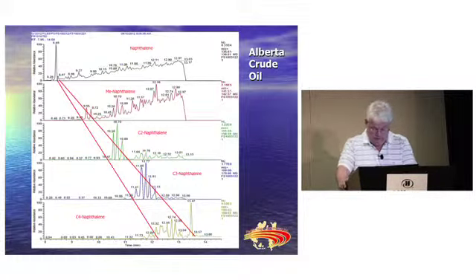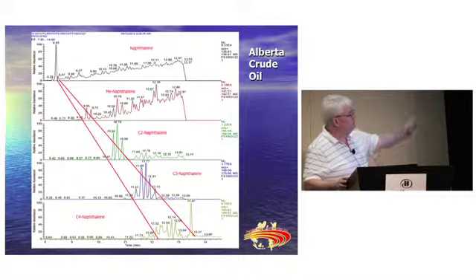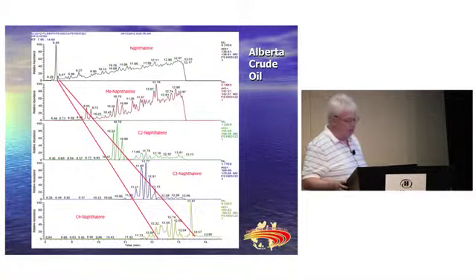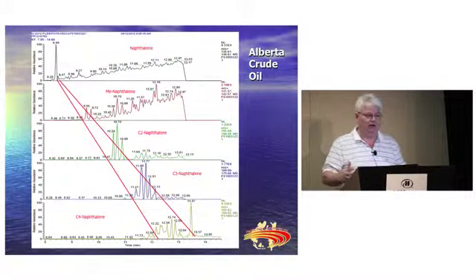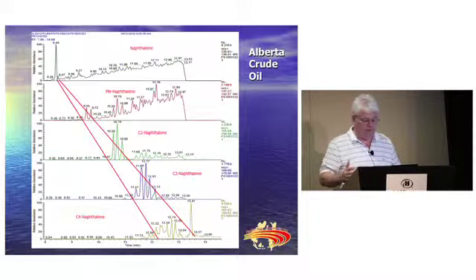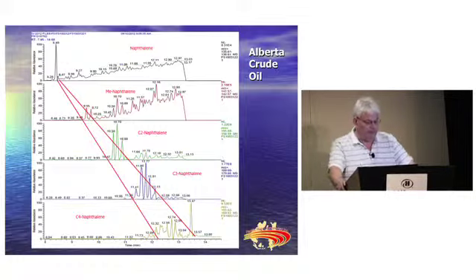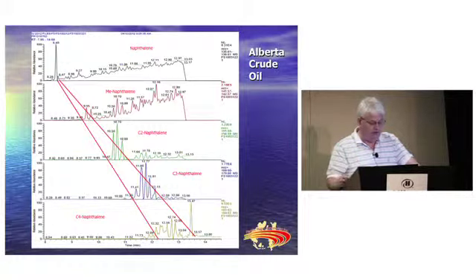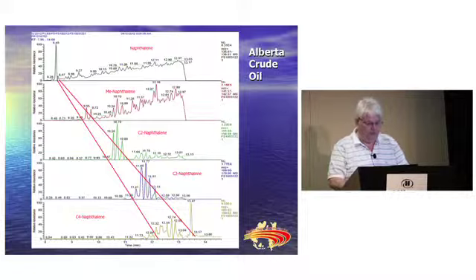What I like to do is put in a couple of little lines going right down from the parent ion, or the parent PAH, and your alkylateds tend to fall within the windows of those ions. So the first line is naphthalene, followed by 2-methyl and 1-methyl naphthalene, then some C2 naphthalene, C3, and C4. As you go down, the absolute intensity decreases and the width of the selection increases.